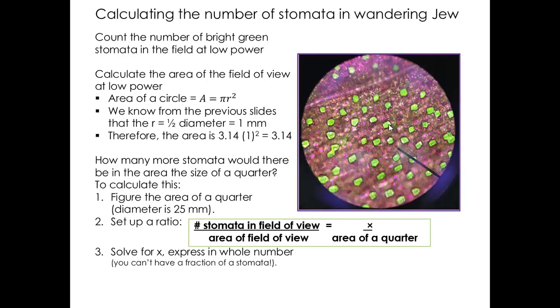Stomata is what opens up to let carbon dioxide in, and that's where the chloroplasts are located, the little green things that do photosynthesis. And then they open up again to let out the oxygen that we are happily going to breathe in ourselves. If you could zoom in here really closely, they look like a little mouth. It opens and closes to prevent loss of moisture during the heat of the day and stuff like that. But it opens to let gases in and out.